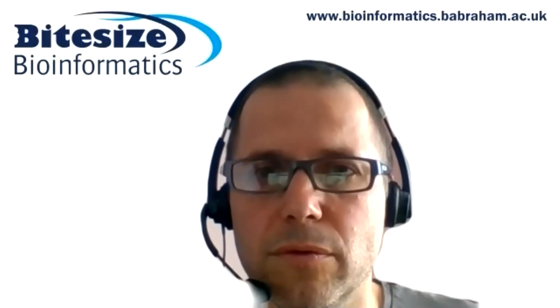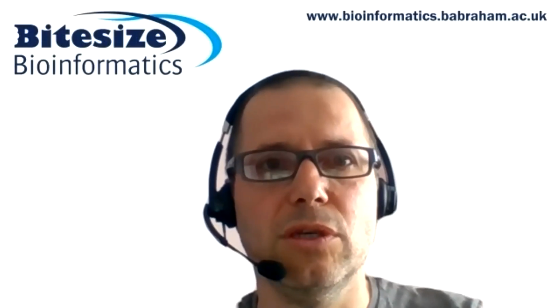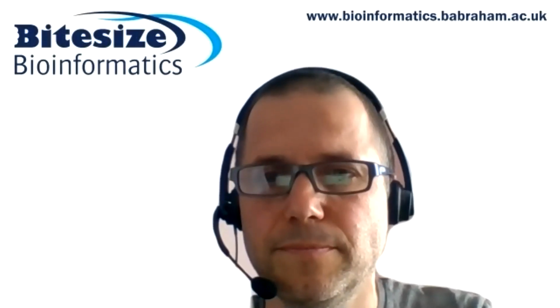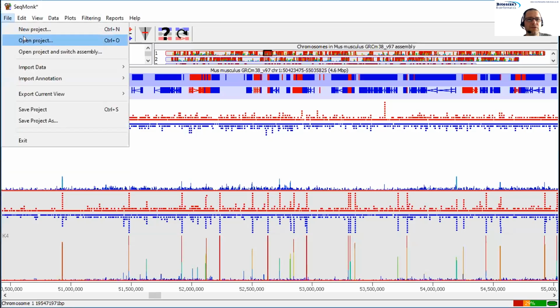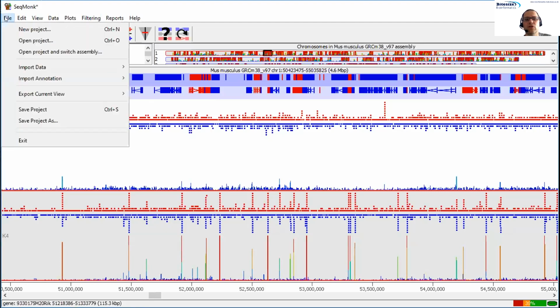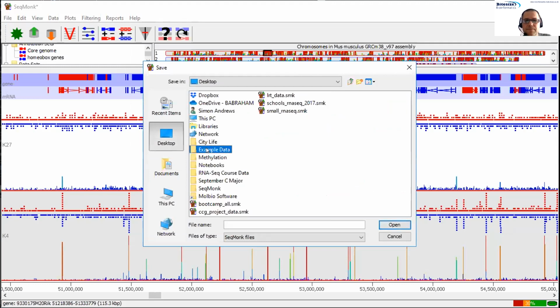Right, for the last little bit that we're going to do, I'm just going to switch back again to SeqMonk. And I'm going to switch to a different data set. So in here, once you've finished with what you've done, you can save your project. So if I say save project, and I will go into here.